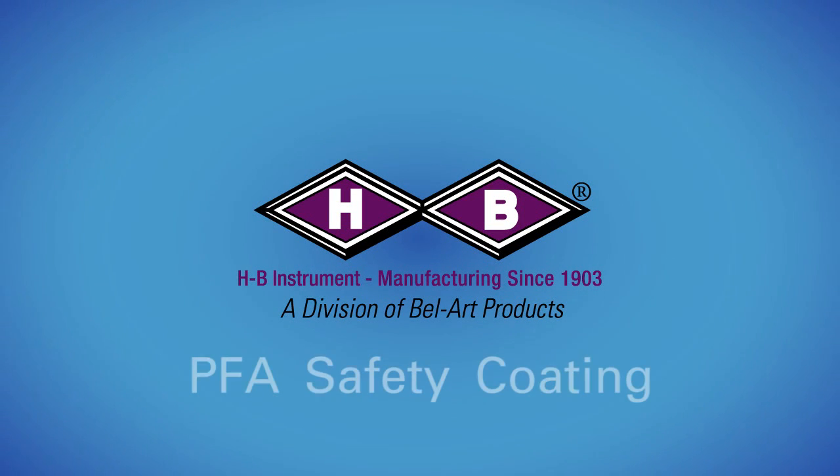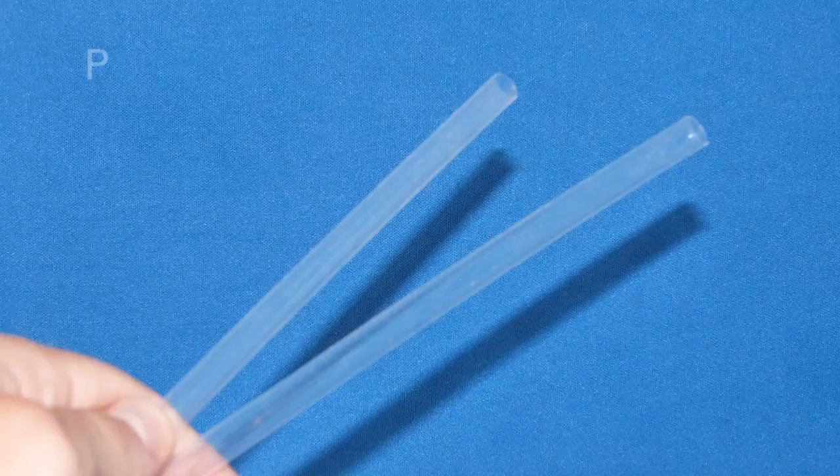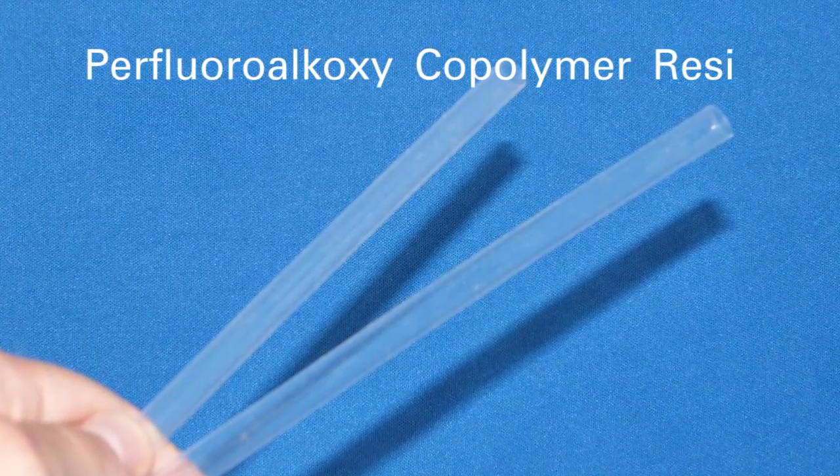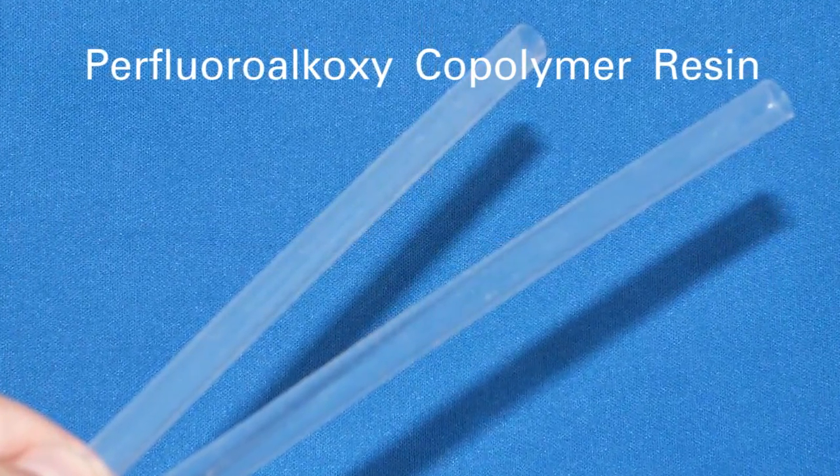The following is an educational video from HB Instrument on PFA safety coating. PFA stands for perfluoroalkoxy copolymer, which is a flexible rubbery material with a low coefficient of friction.